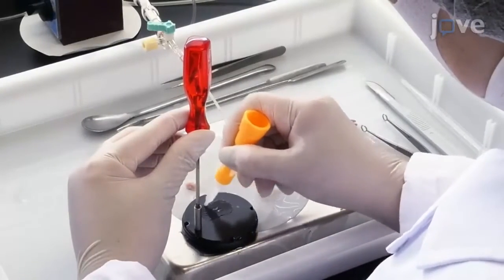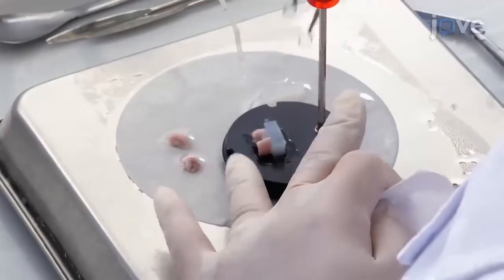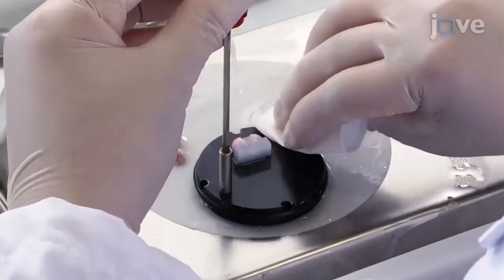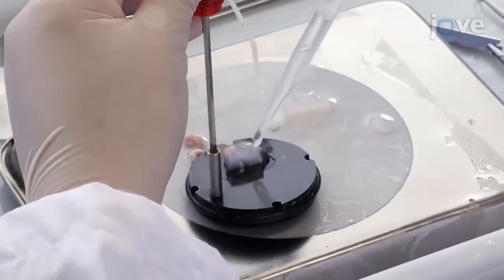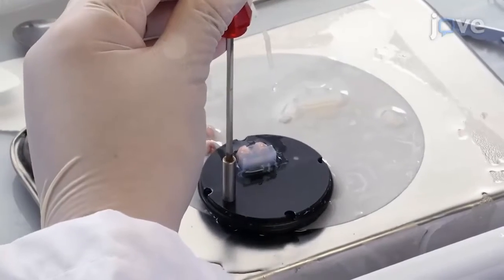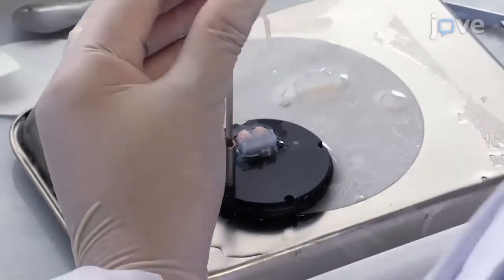Subsequently, apply superglue to the vibratome platform. Place the agar block on it and wipe the excessive adhesive with a filter paper. Gently apply a small amount of ice-cold ACSF from the top of the brain agar block to help solidify the excess superglue and to prevent the glue from covering the brain and disturbing the slicing.